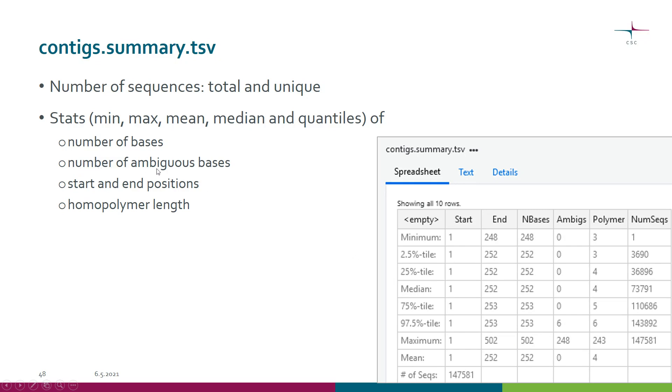We also get the number of ambiguous bases. There was a read that had 248 ambiguous bases - again something we will want to remove later on.